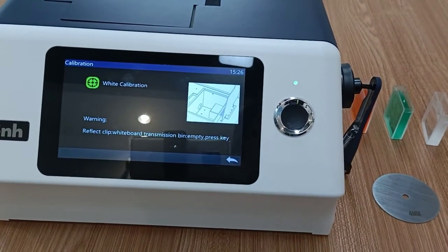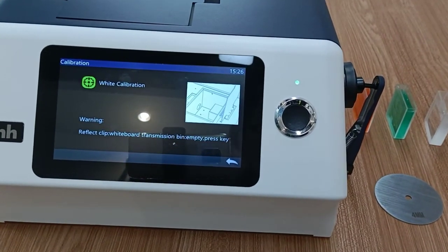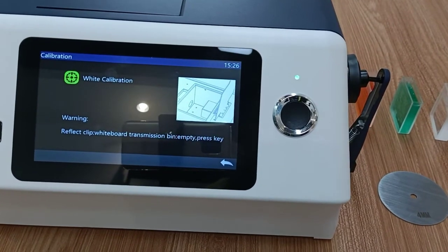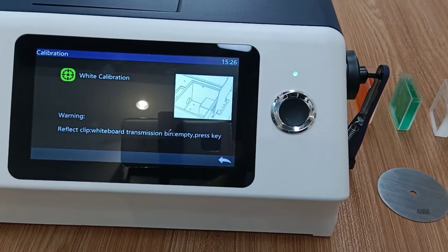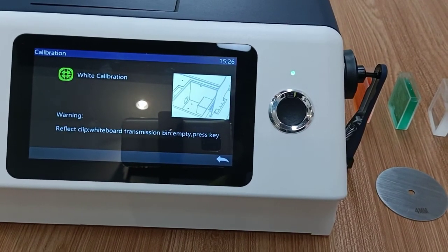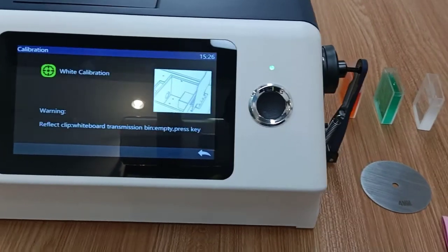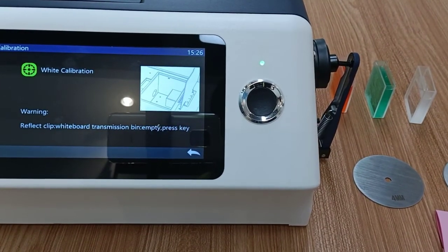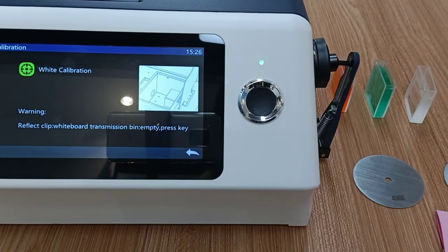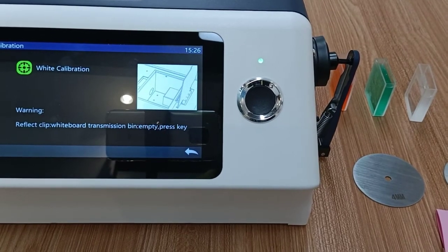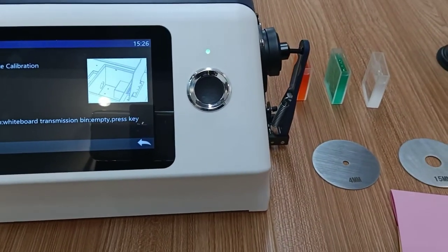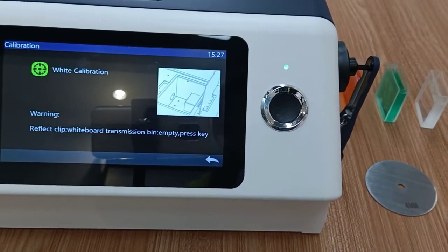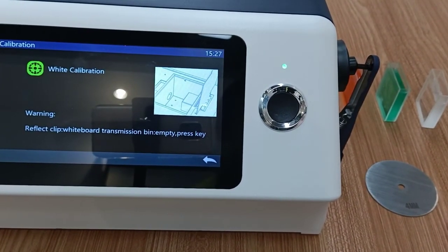Then there is white calibration. Here is an important note: when measuring transmitted liquid, white calibration is done with distilled water. When measuring transmitted solid, white calibration is done with air. Since we are testing liquid now, we do the calibration with distilled water.